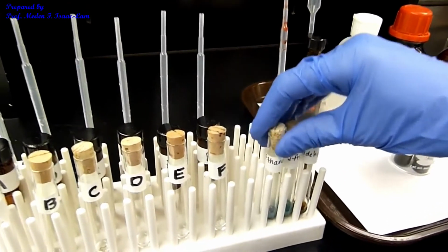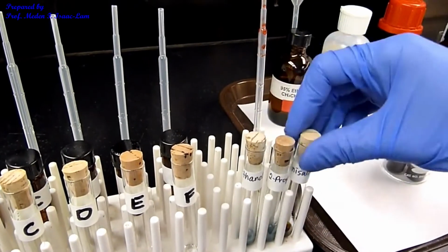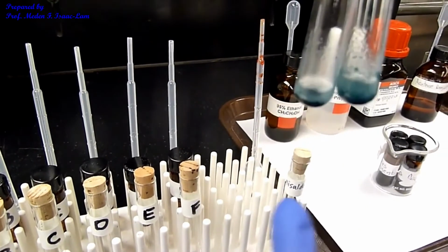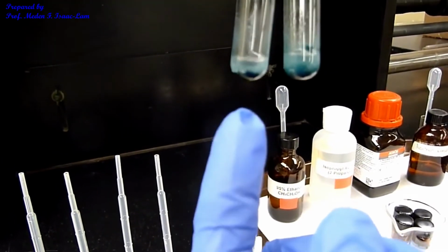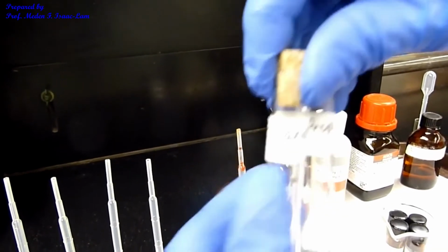So, gonna shake it a little bit. Shake. Shake. So, ethanol on the left and then 2-propanol on the right. So they turned green or blue-green in color. So it reacted. It actually got oxidized by the oxidizing agent.